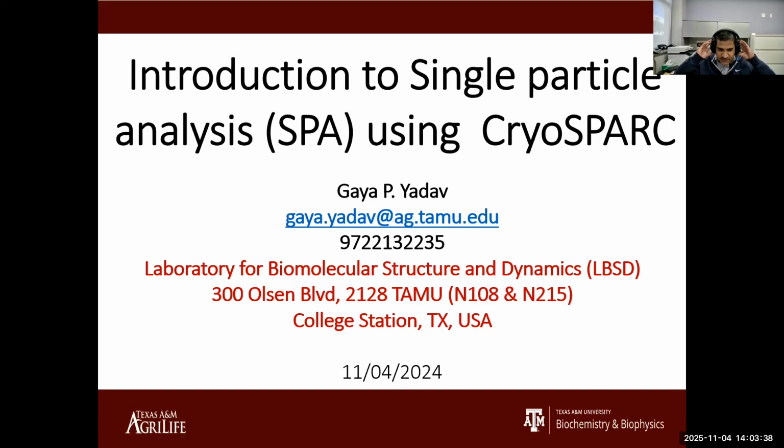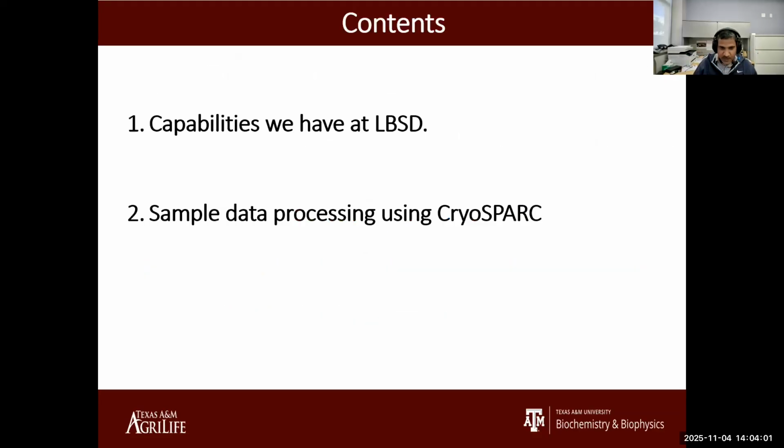Hi, everyone. My name is Gaya Yadav. As Mike mentioned, I'm the Cryo-EM Technical Director at the Laboratory for Biomolecular Structure and Dynamics. And today I'm going to walk you through how to process the single particle Cryo-EM data for a single particle reconstruction using CryoSPARC.